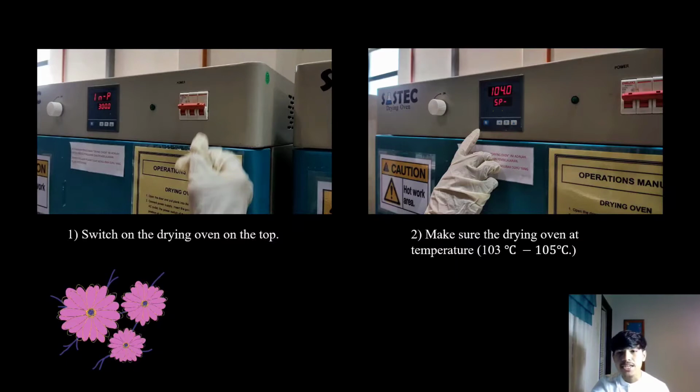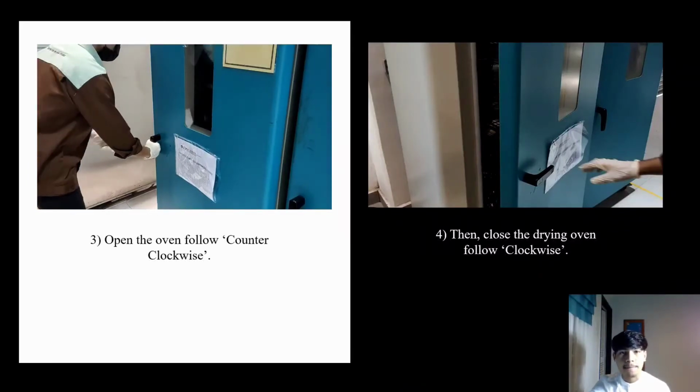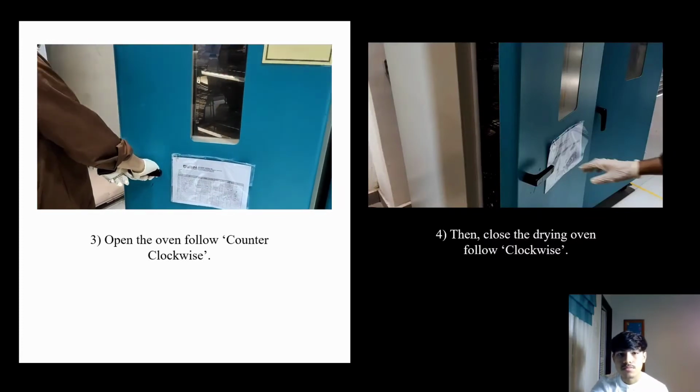Second, make sure the drying oven is at a temperature in the range of 103 degrees Celsius to 105 degrees Celsius. Step 3 is to open the oven, turning counterclockwise. And lastly, after opening the drying oven, close the drying oven, turning clockwise.